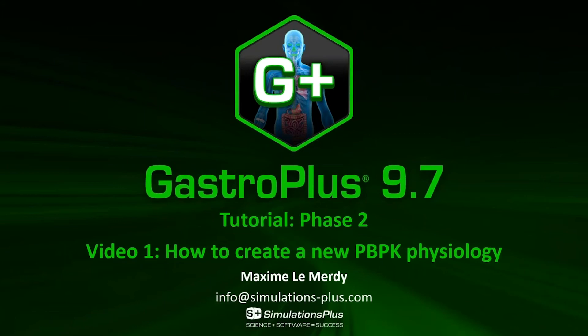Hello and welcome to the first video of the GastroPlus 9.7 tutorial phase 2. In this video, I will demonstrate how to create a new PBPK physiology.